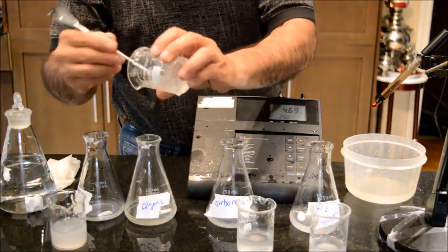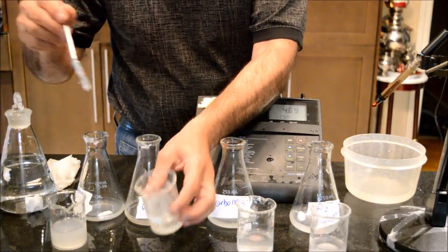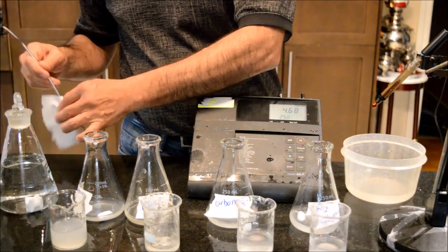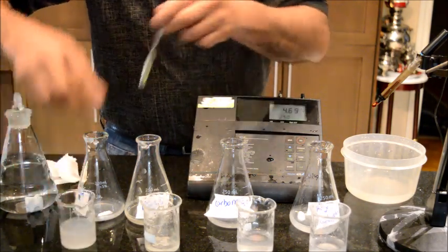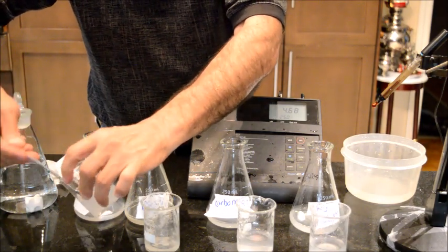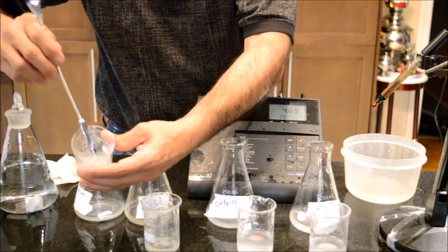It's very gooey stuff. And Xanthan gum remains as is, a little bit reduced in viscosity because of the added liquid, but other than that, it still retains the structure.